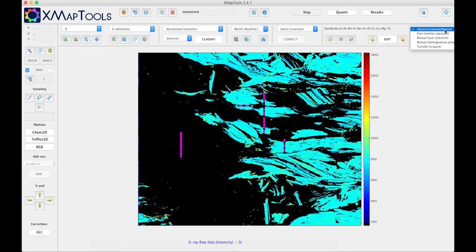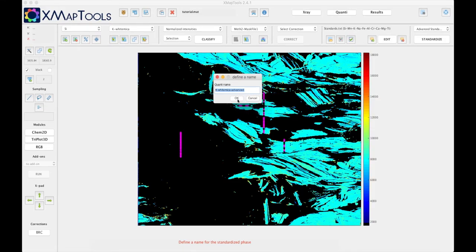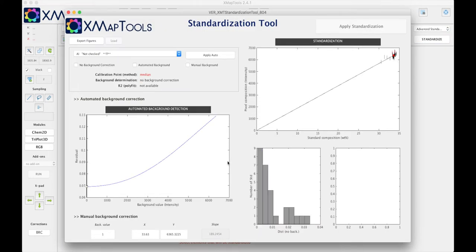You can select the new standardization function in this menu and click on standardize. Now we need to define the name of this new standardization and select the elements to be calibrated. In this example all of them, and the program opens this standardization tool.